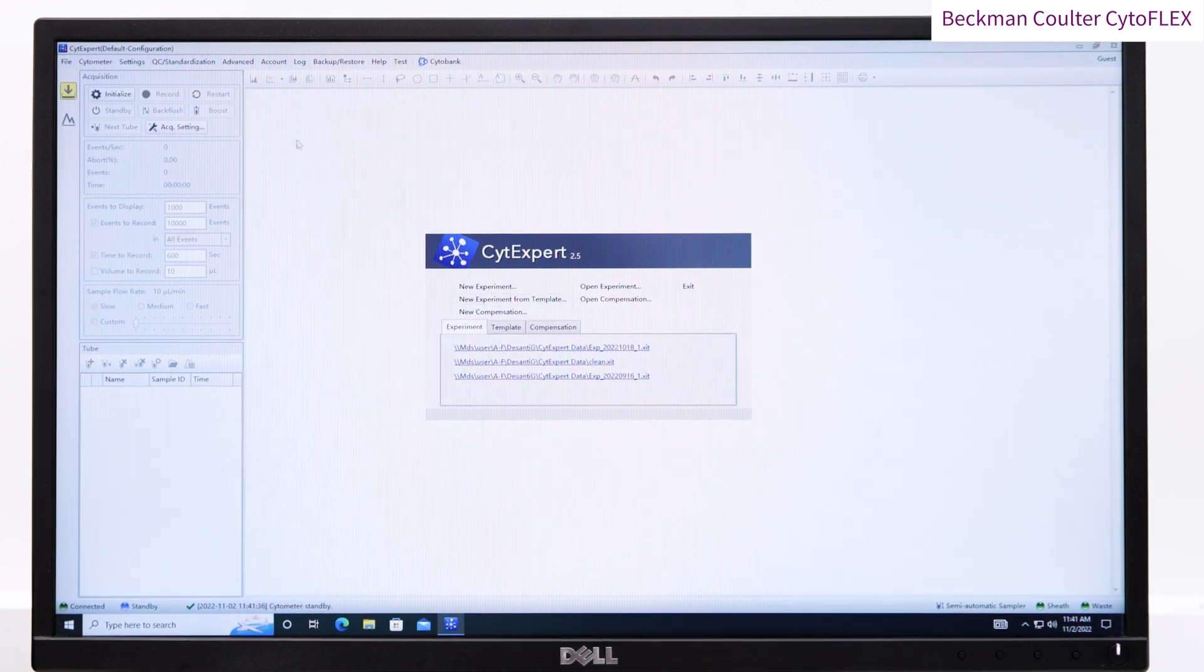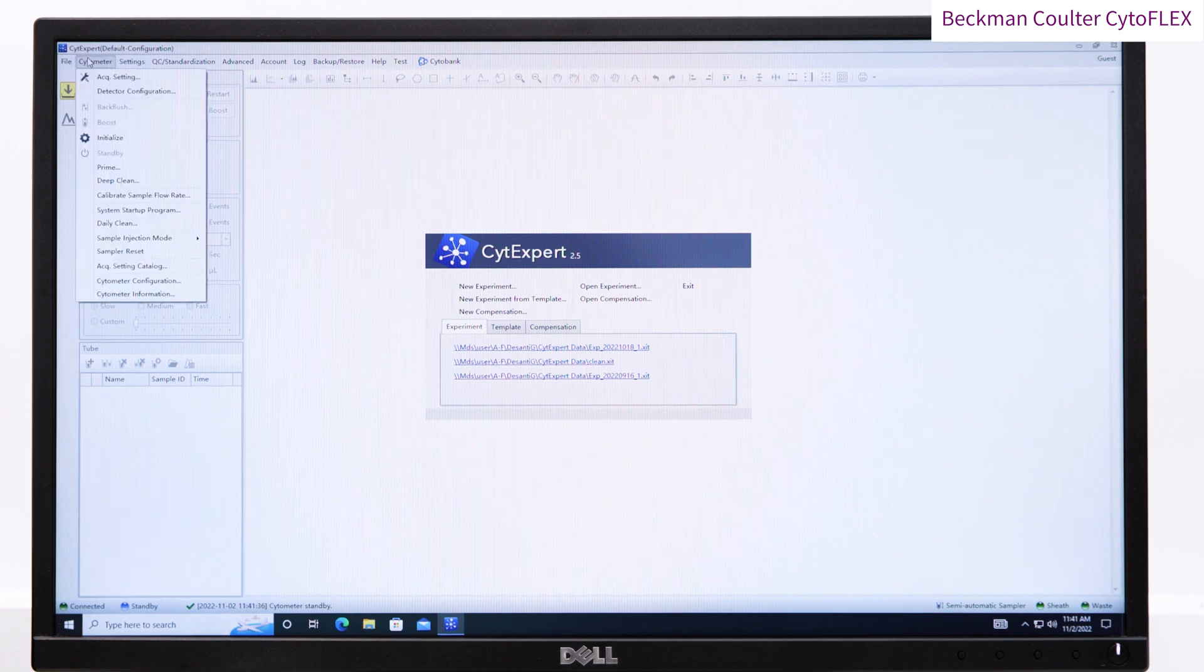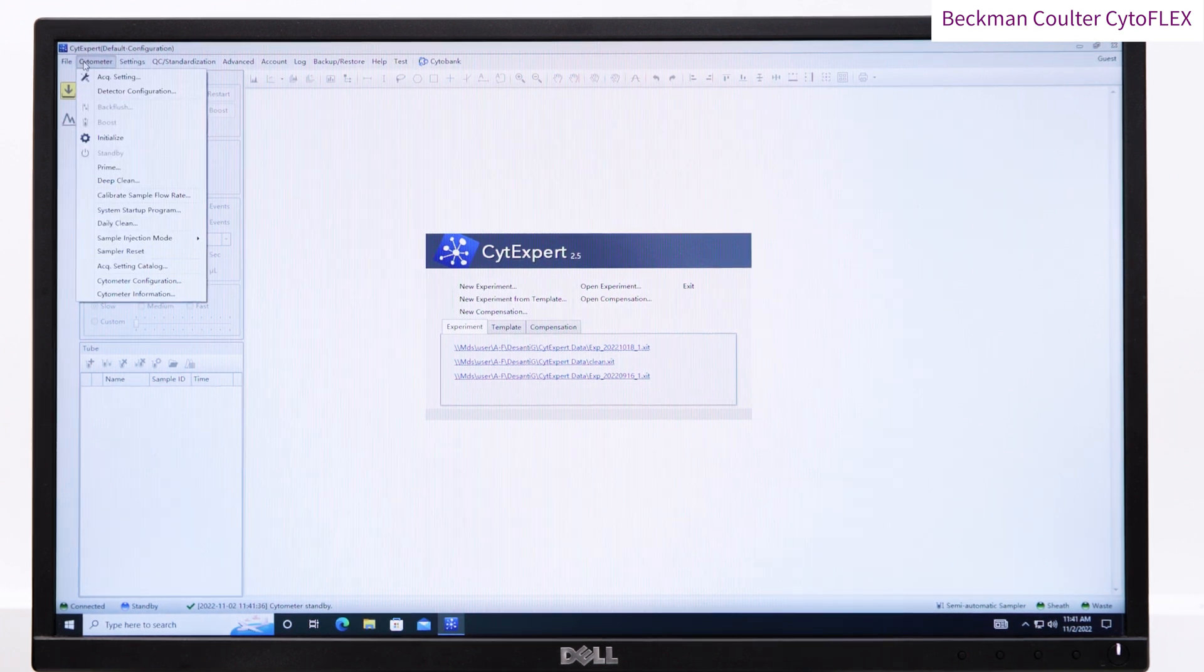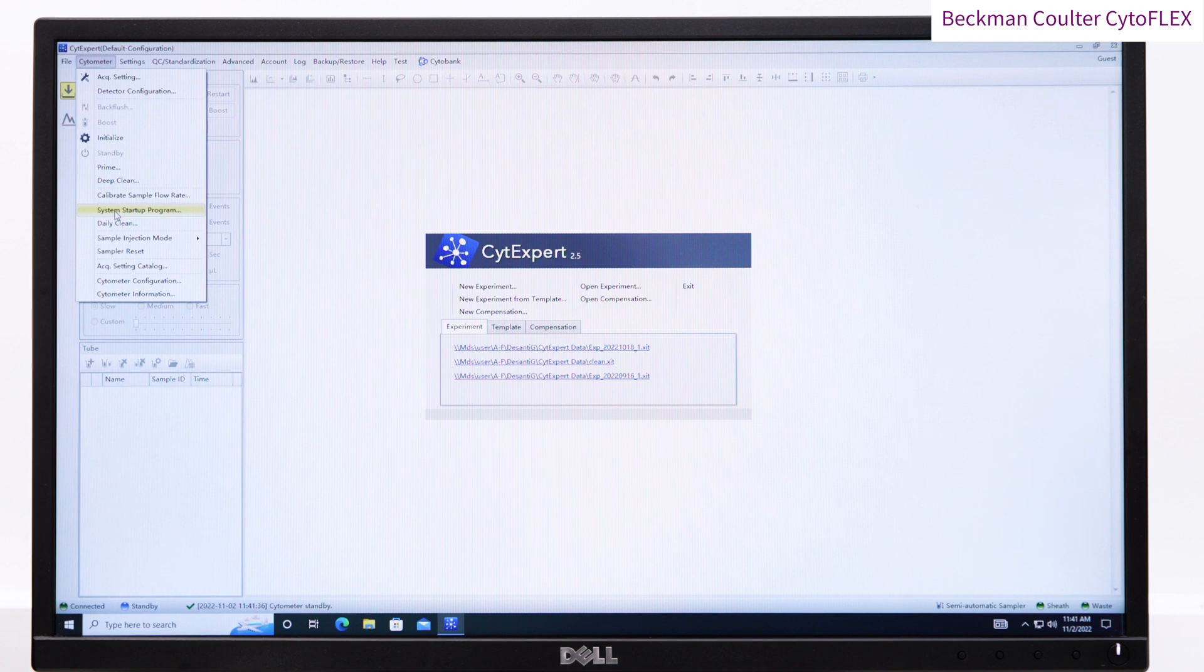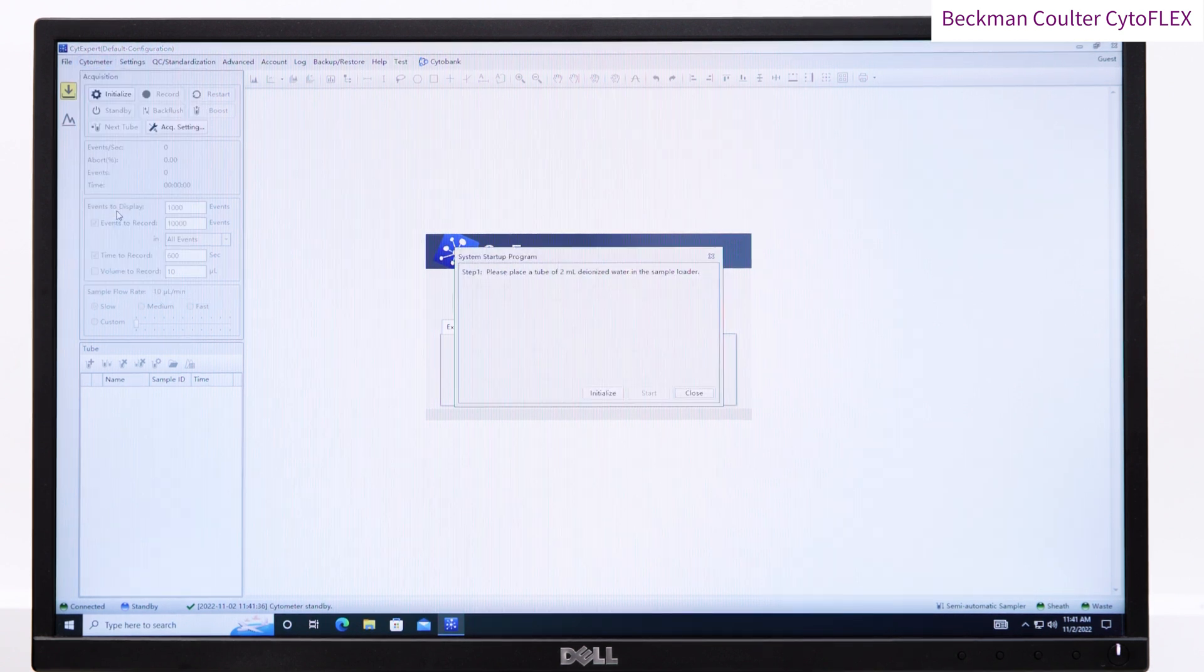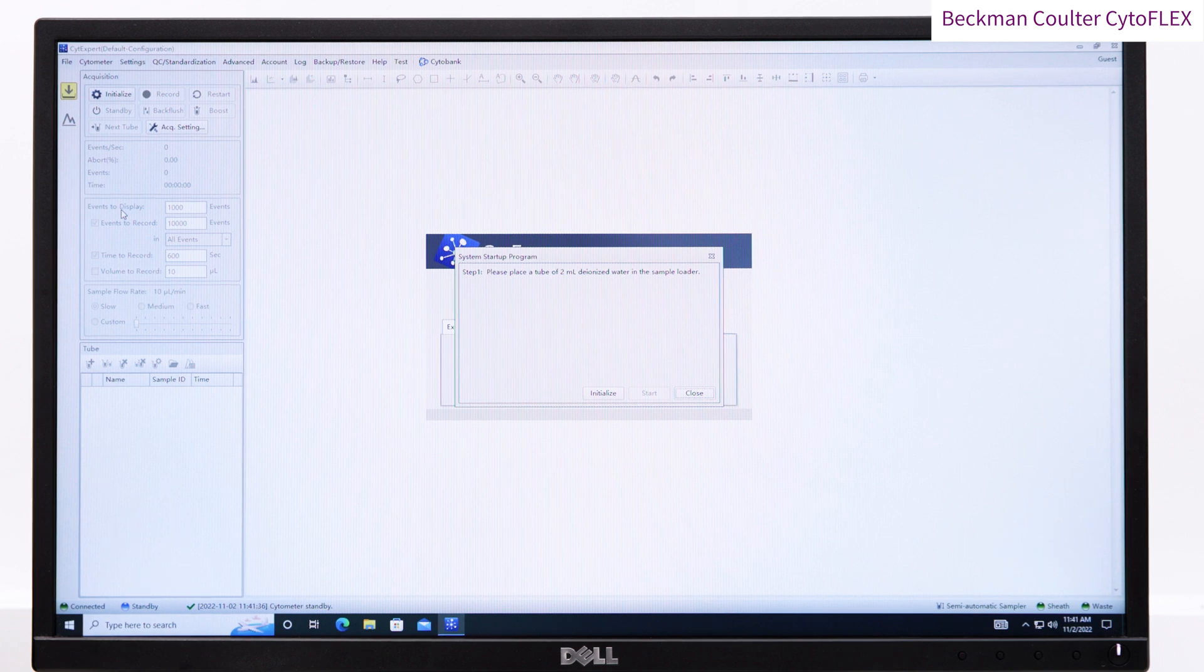You may wish to run QC beads. To do this, click QC Standardization and start the daily QC following the on-screen prompts to load the daily QC beads. Once the machine has passed the daily QC, you can proceed to your experiment.